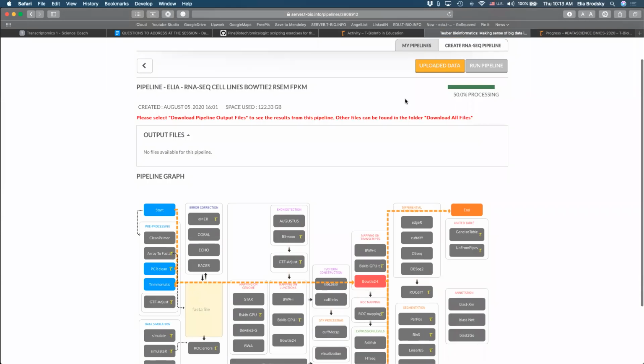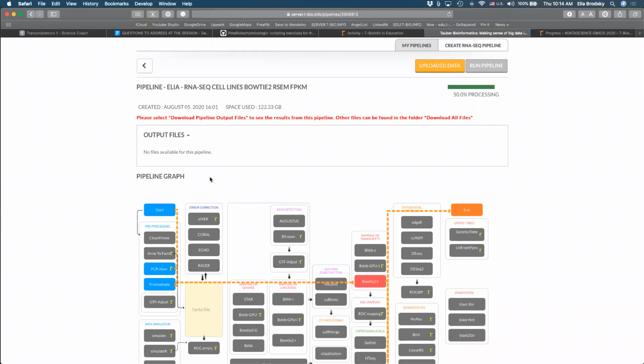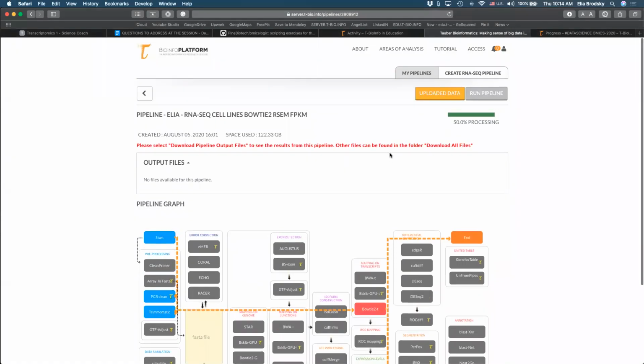And the reason that typically this type of data is analyzed on some kind of a server or on the cloud is because of these huge file sizes. Now you can, of course, remove these files, but remember that we only have really 10 files in here. So this is not even a large experiment. If you look online, on NCBI, for example, some of these experiments have hundreds of samples. So you can imagine how much larger pipelines are going to become after you analyze real data sets from these large, for example, human RNA-seq. You know, the genome is large. You have over 20,000 genes. Whole genome sequencing might be even larger.